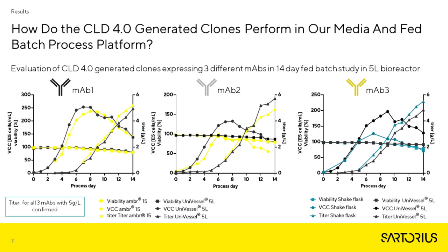So I think due to the optimized conditions in a bioreactor, you can expect that this was a little bit better, but nevertheless, when you look at the titers, what we see is that it's very much scalable and very much comparable, and these elements really seem to have a very significant effect on the productivity itself.